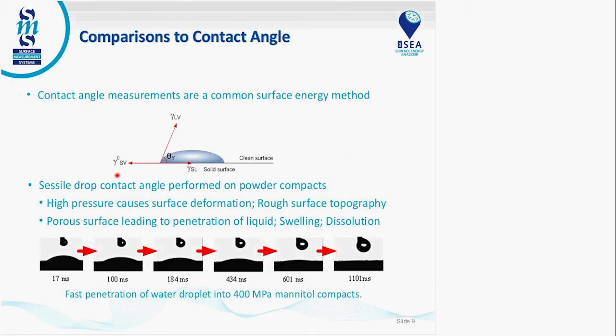More people are maybe more familiar with contact angle. Contact angle is a liquid-based technique where you put a droplet of a liquid onto a surface, measure the contact angle, and the contact angle is related to the surface energy. Contact angle works quite well for flat, homogeneous films, but once you start using powders or fibers or granules, it becomes much more difficult to get accurate and reliable results. There are other processes like the Wilhelmy technique and powder compaction, but they're not ideal.